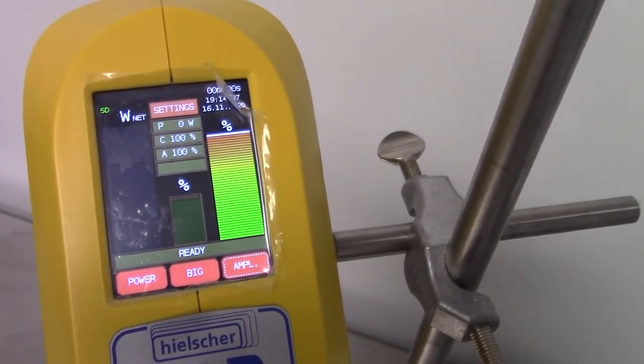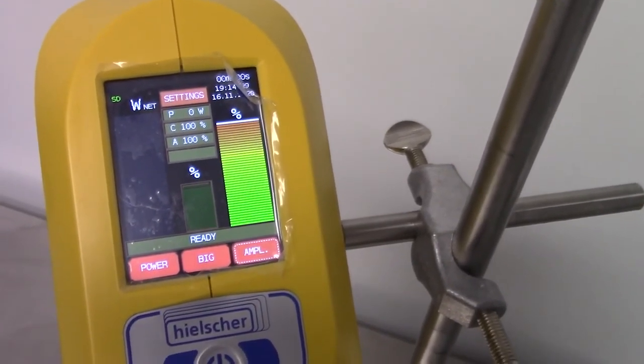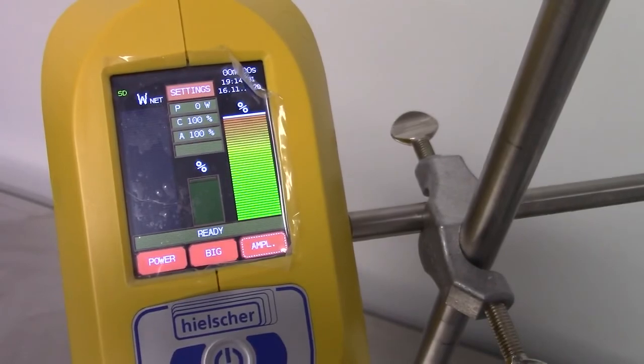The calibration is now finished. Thank you from Hielscher Ultrasonics.